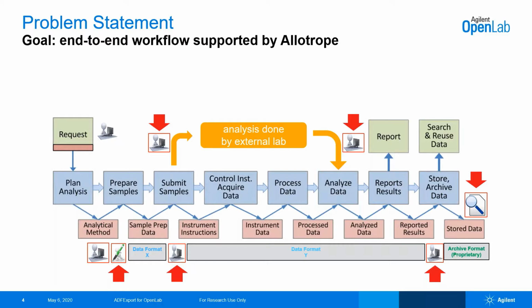So if we look into labs today, how can ADF help? How can labs add value to their workflows, and how can they generate return on investment short term? If you look into labs, and this means not only pharma labs, there are major pain points.